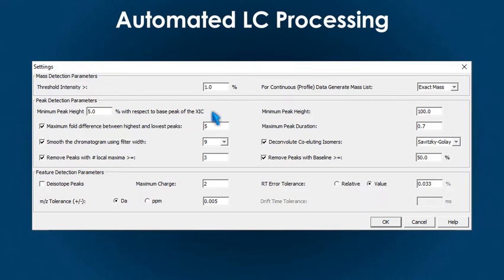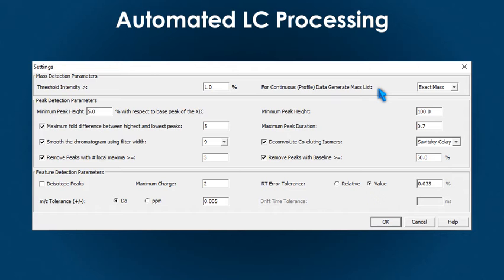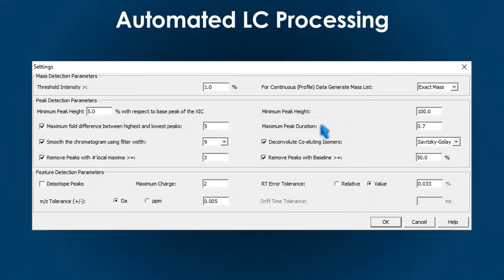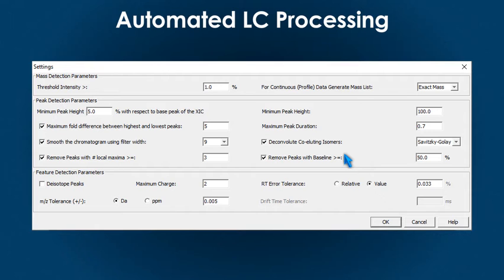For LC-MS-MS experiments, the MS-MS scans are automatically clustered to their corresponding peaks for confident lipid identification. You can perform LC peak corrections based on chromatographic peak parameters, smoothing, and filtering to improve peak shape and appearance.